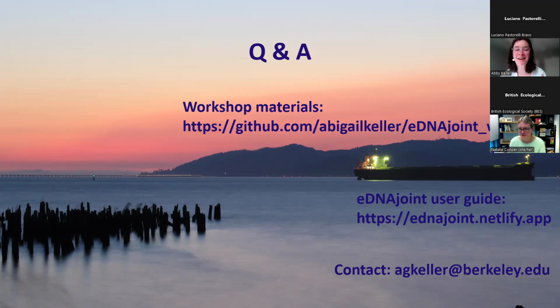But again, I'm definitely interested in expanding the package, and that would probably be the lowest hanging fruit, thinking about copy number rather than presence absence. So again, email me if you're interested in joining, but that is definitely a priority for expansion.